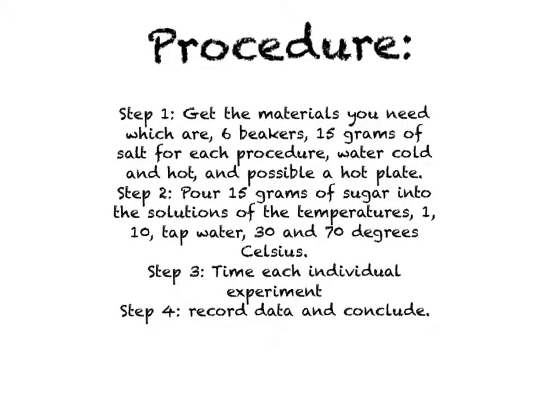To do this lab, you need to follow the following procedure. Step 1. Get the materials you need, which are 6 beakers, 15 grams of salt for each procedure, water, cold and hot, and possibly a hot plate.